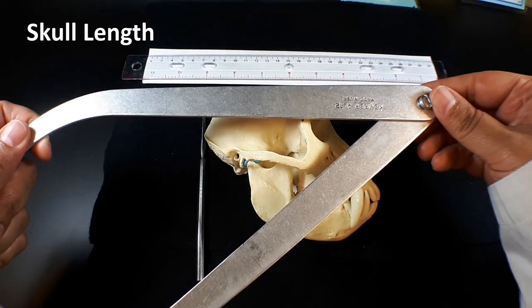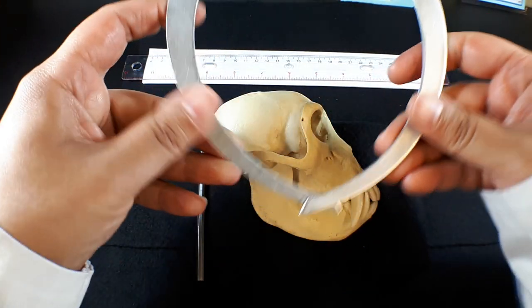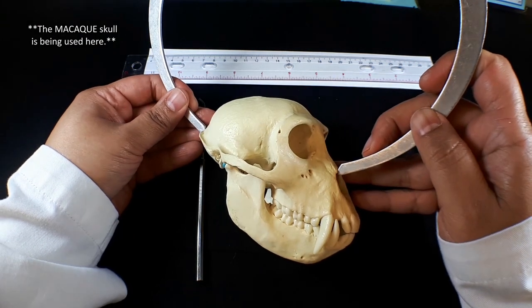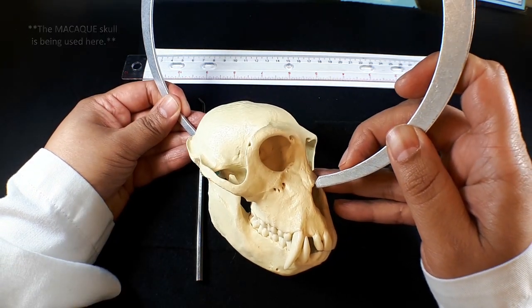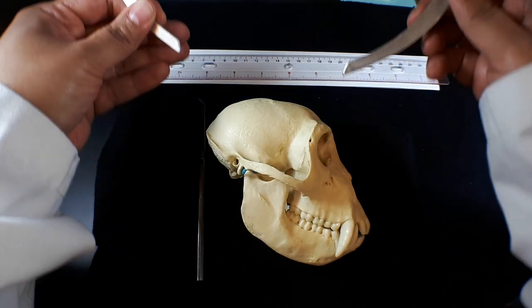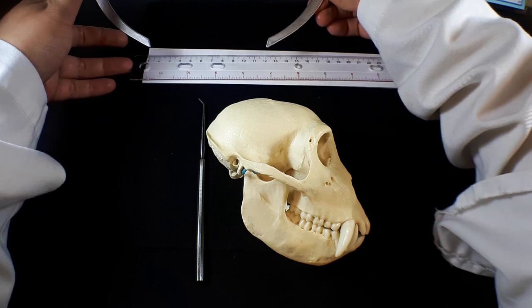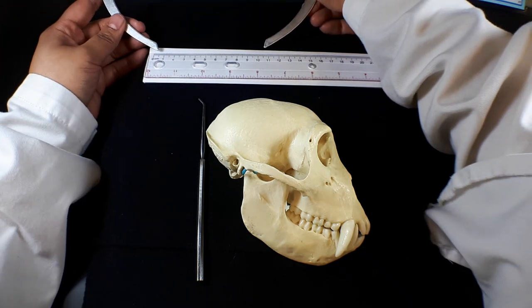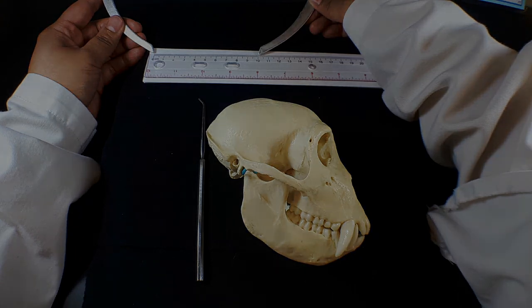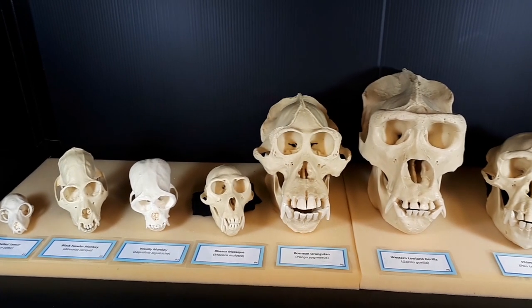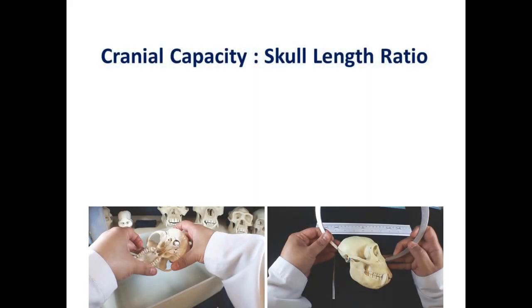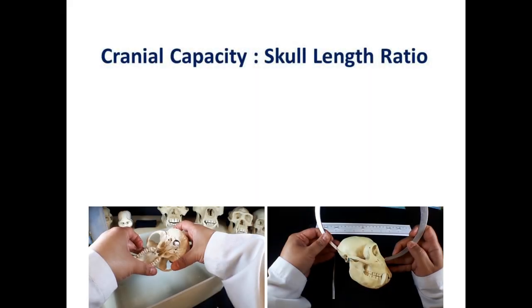Use the calipers to measure the length of the skull from the top of the nasal aperture to the back of the skull. Be careful not to change the angle of the calipers. Use a ruler to measure the distance between the points and record this value as the skull length. To account for differences in overall skull size between the primates, we can determine the ratio between cranial capacity and skull length.